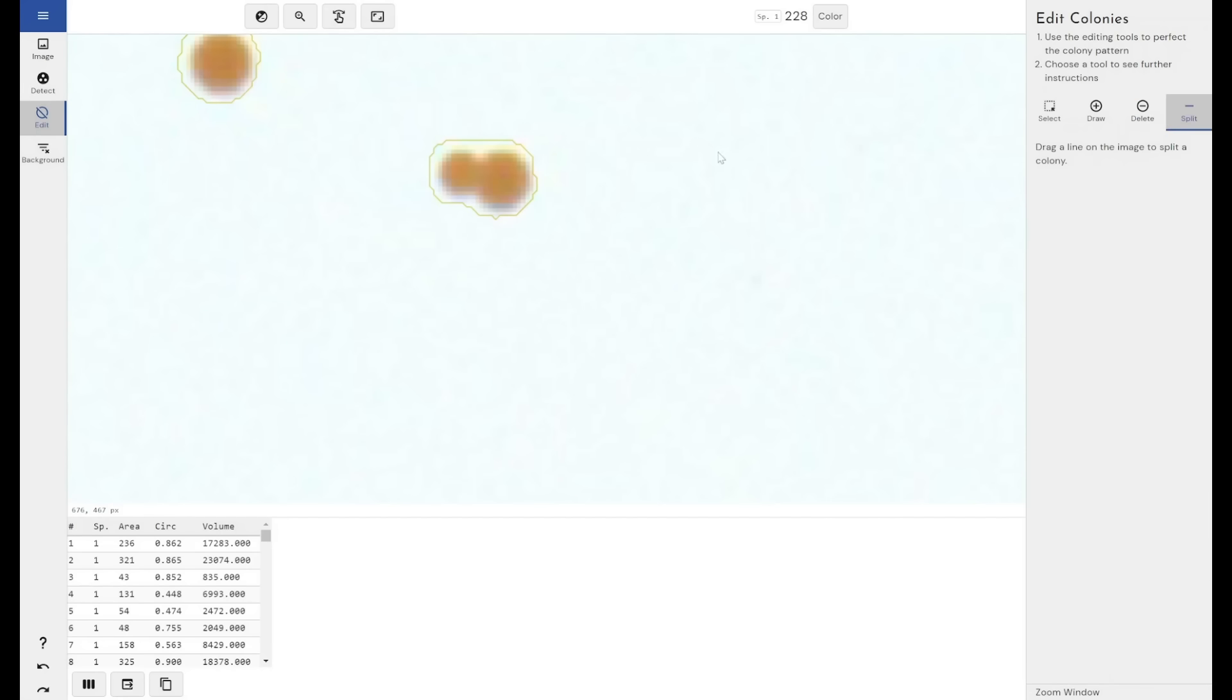But what I can do is come through to the split tool, draw this line down, and then the software will say, this is one colony, this is another colony.